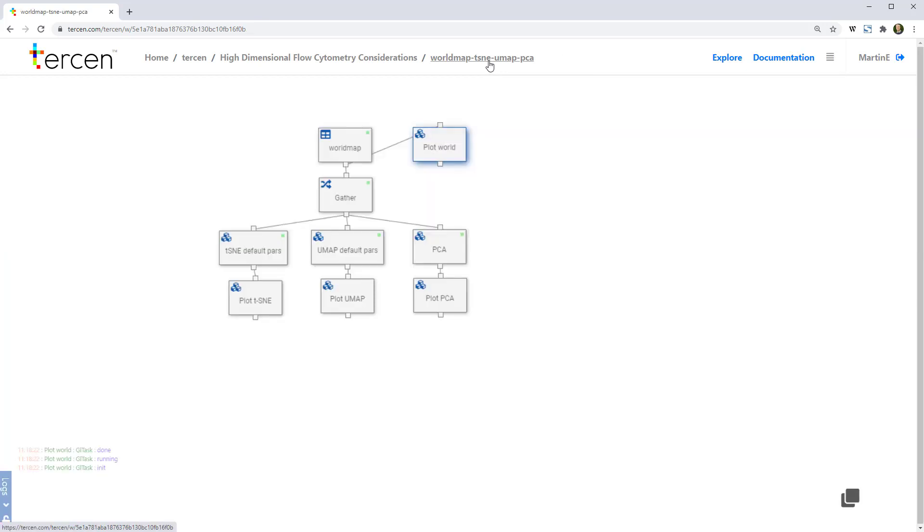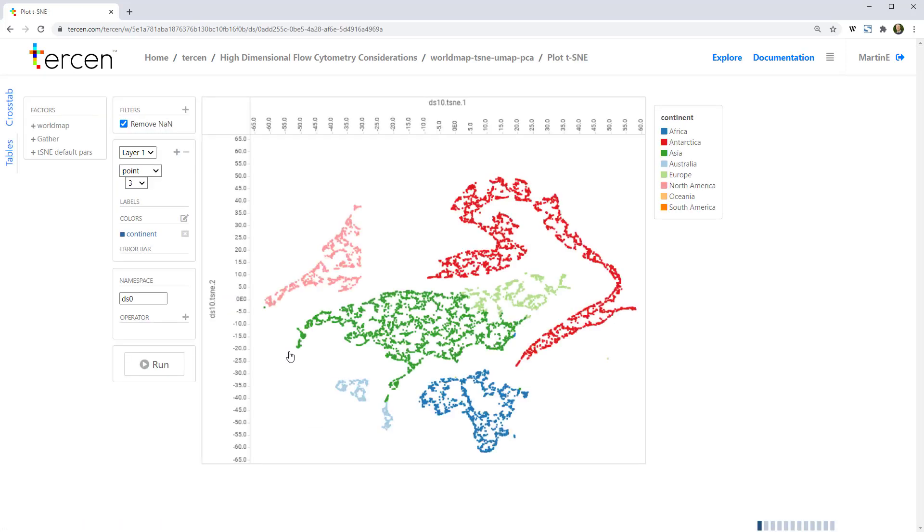In this workflow, we've performed both t-SNE and UMAP reduction. If we look at the t-SNE first, we see that it's done a good job of keeping the populations separated, and their local structure.